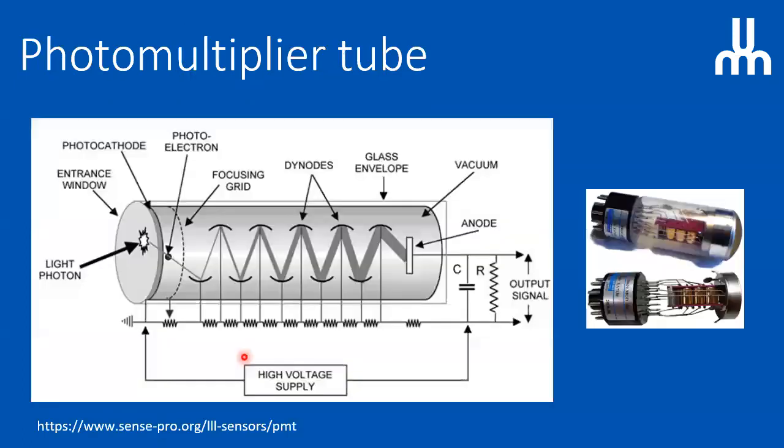I'm just going to give you a bit of an example of what a photomultiplier is. Physically, it looks like a little single tube. The light goes through either from the top or from the side. When a photon comes in, it hits a specific material, and it can sometimes kick out an electron. This has a specific efficiency.